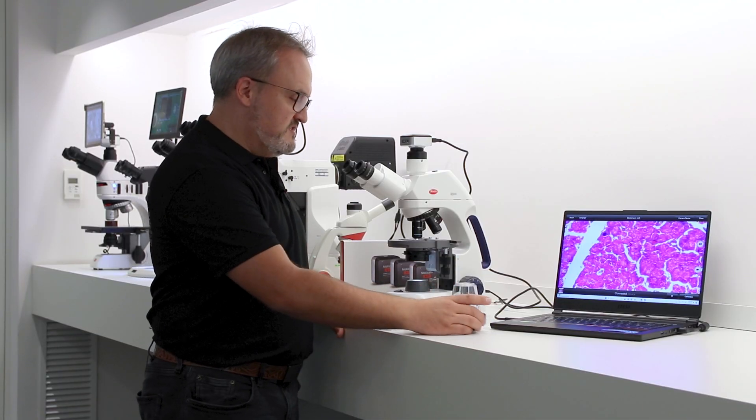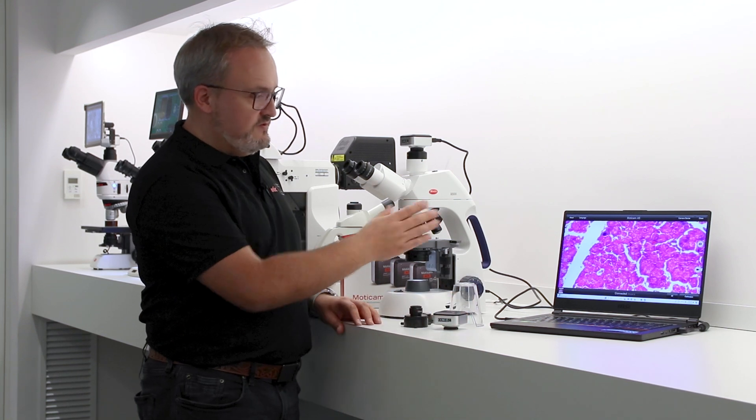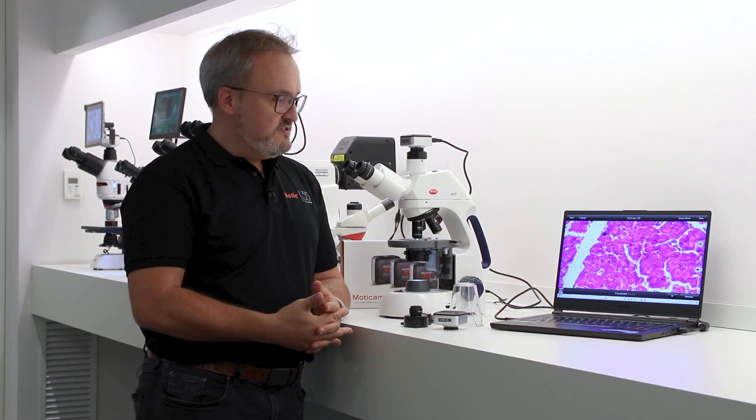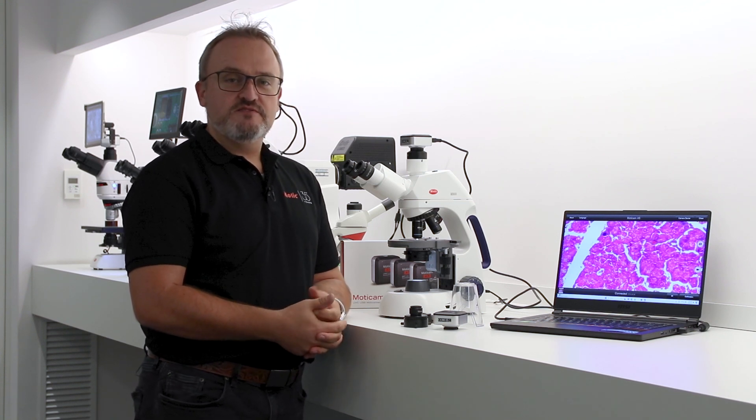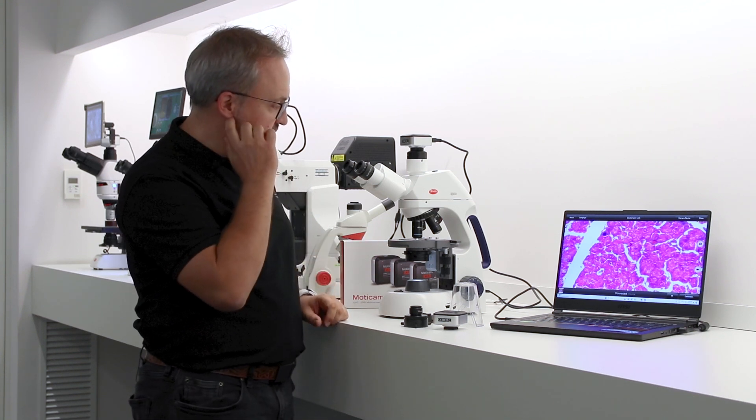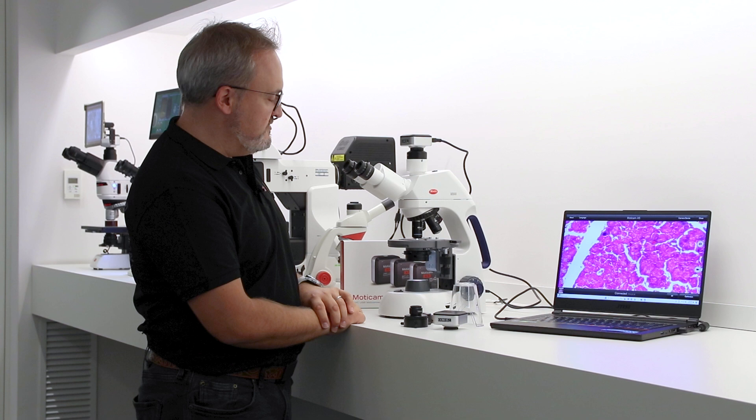What you also get is application software MOTIC Connect with which you can capture, annotate, and later share the image. So you learn something from the image that you're seeing on the microscope.